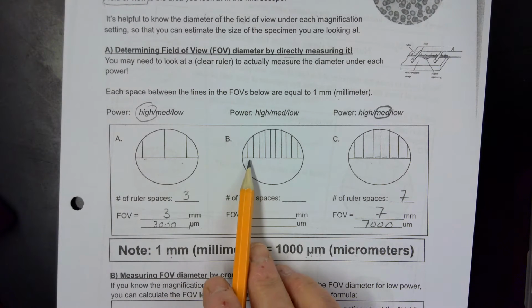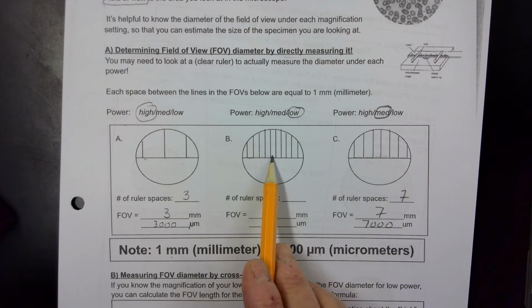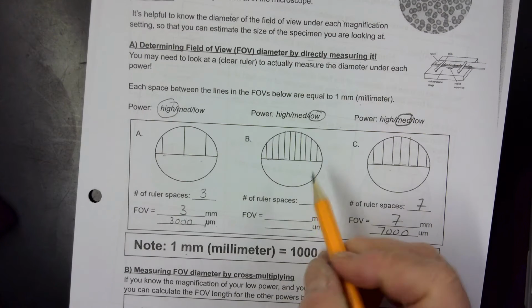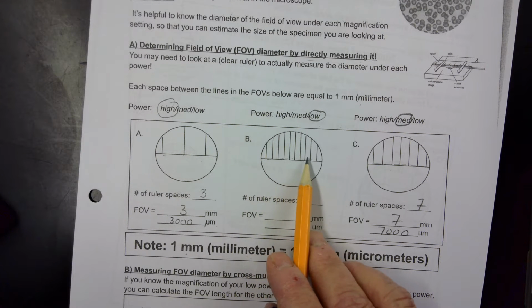Over here is probably the low power. If we count up the full ruler spaces, we've got 1, 2, 3, 4, 5, 6, 7, 8, 9. Patch those together, we've got about 10. Let's count that again. 1, 2, 3, 4, 5, 6, 7, 8, 9.